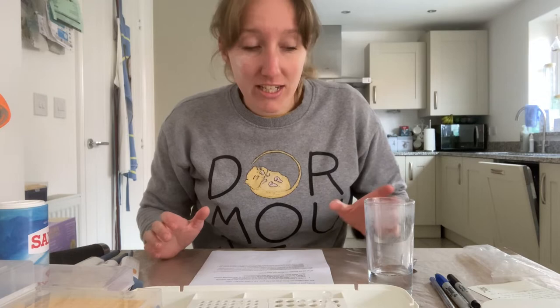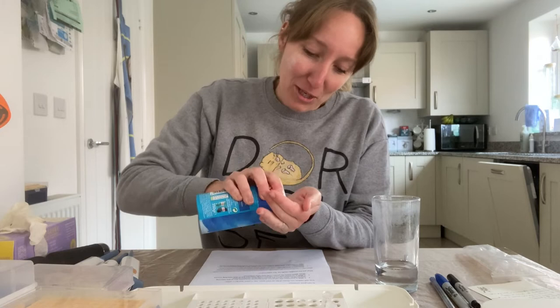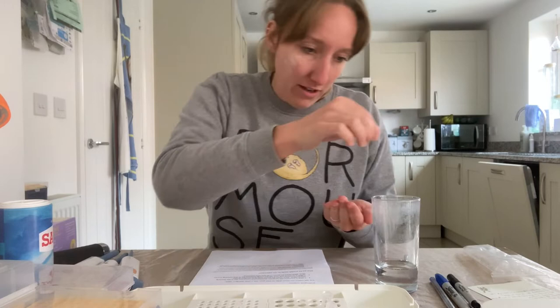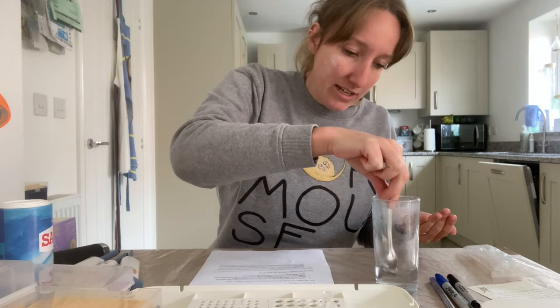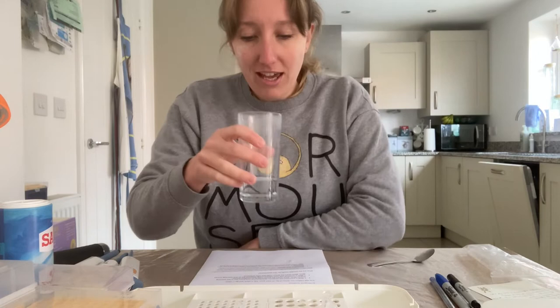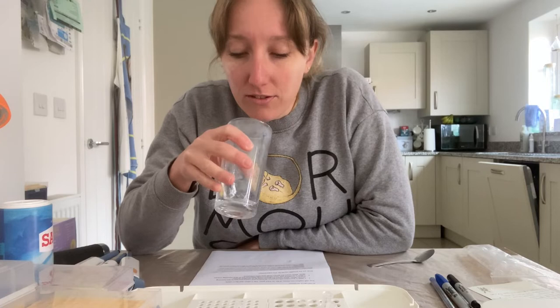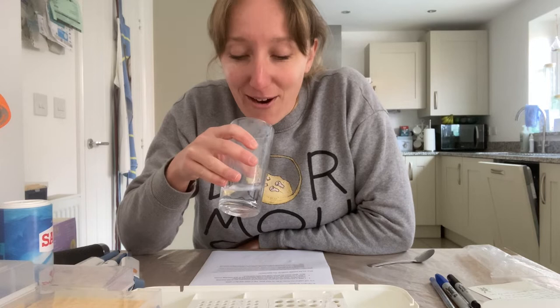To get started with the saliva DNA extraction, I've got a little bit of tap water and I'm going to add a tiny pinch of salt — not too much because I'll probably be quite ill. I'm mixing that in, and now I'm going to take a mouthful of that salt water and rinse it around in my mouth to dislodge the cheek cells. Then I'm going to spit it back out and that's what we'll use for my DNA extraction.